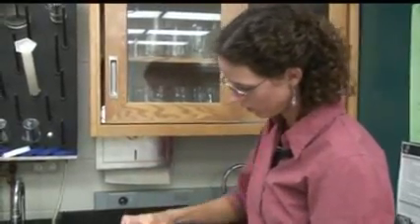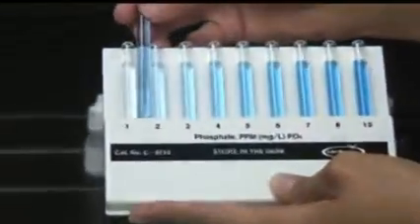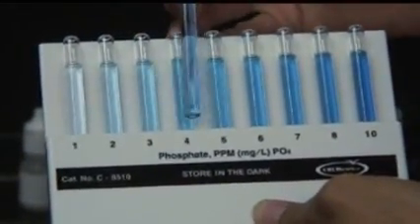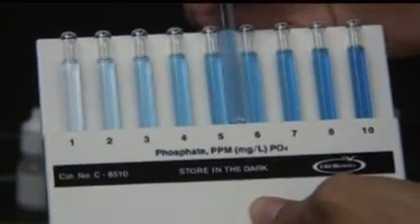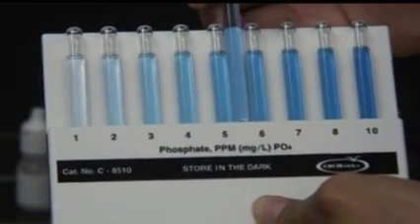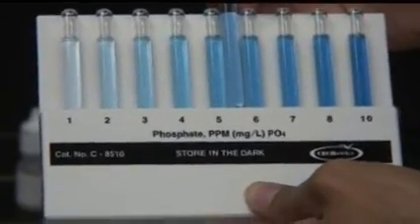To show you the plate, we've developed a darker solution. You can see that it's darker than one, darker than three, a little darker than four, somewhere lighter than six — so it's around five parts per million of phosphate.